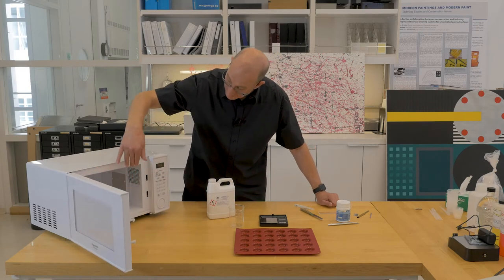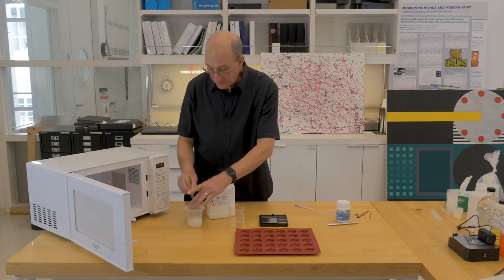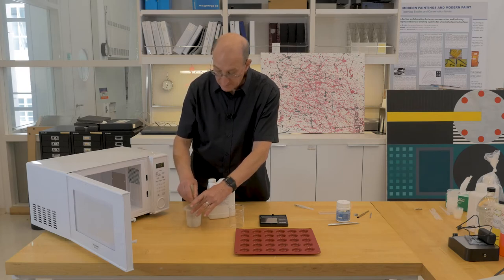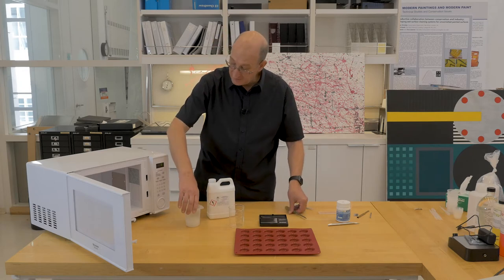You can see it has foamed up and is now coming back down. So very carefully, not touching where the liquid is, we remove it and stir. I'm going to give it one more five-second pulse.